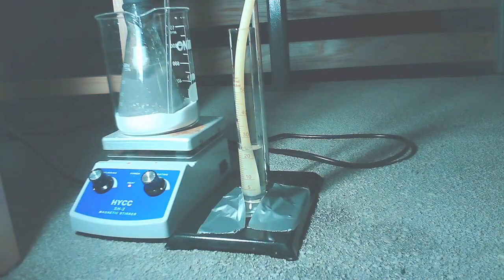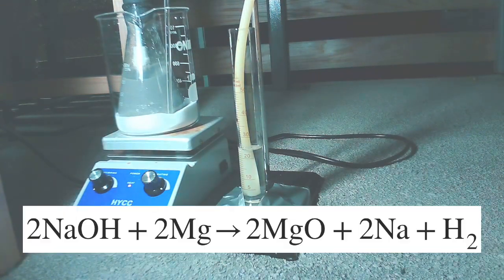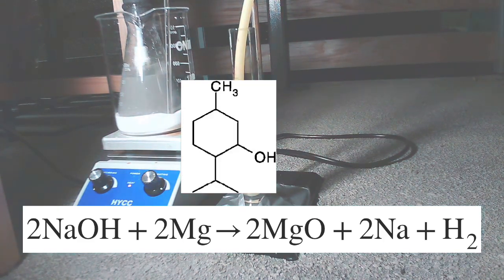In this experiment, I recreate the alcohol-catalyzed magnesium reduction reaction to make sodium metal. In this reaction, two molecules of sodium hydroxide react with two molecules of magnesium via an alcohol catalyst — menthol in this case — in order to produce two molecules of magnesium oxide, two molecules of sodium metal, and a molecule of hydrogen.